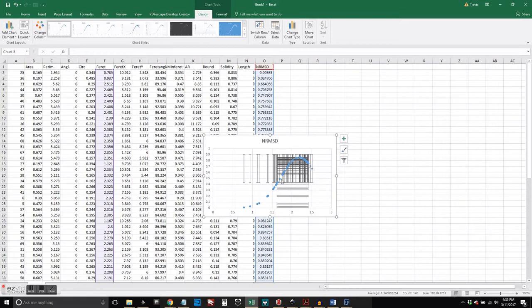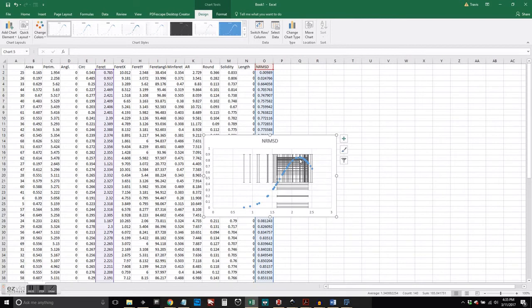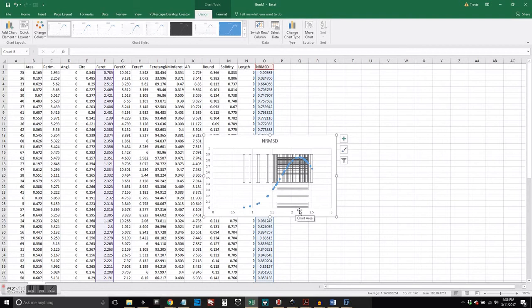And that most of those there are going to be up at the peak there. And that's exactly what you would expect to find with this normal distribution.